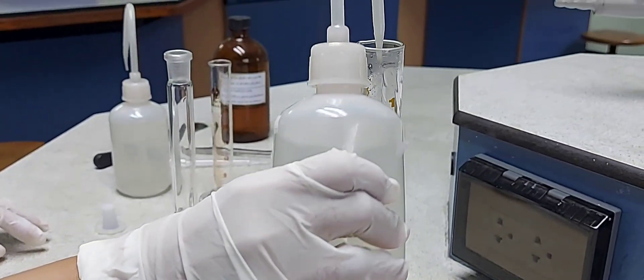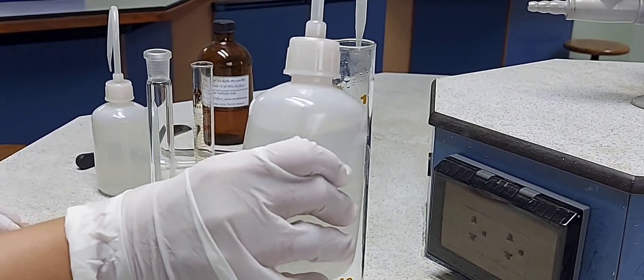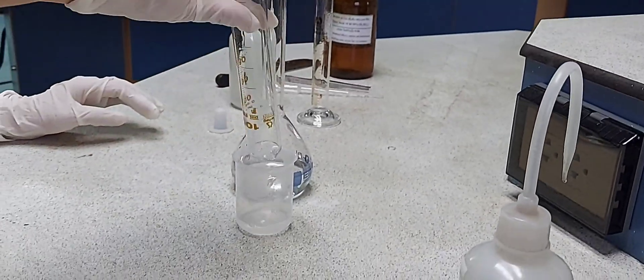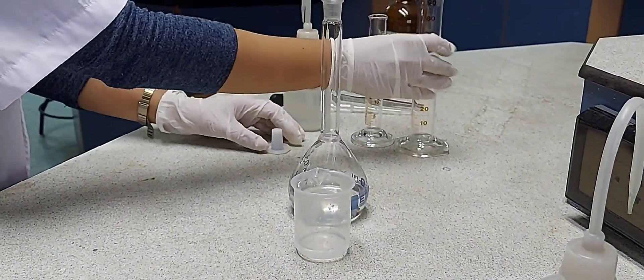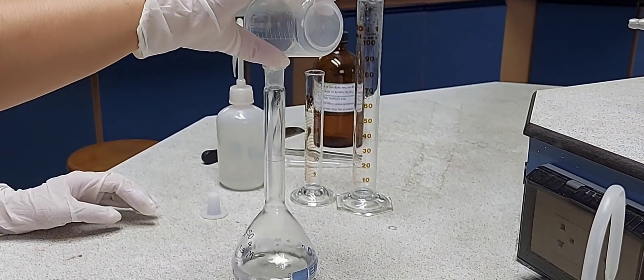Rinse the sides of the measuring cylinder with distilled water and add it to the beaker. Rinse the sides of the beaker and then add it to the graduated flask.